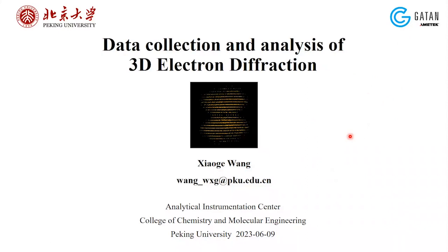Thanks, Gatan, for arranging this webinar. Today, I will mainly talk about data collection and the data analysis of the three-dimensional electron diffraction. For the data collection part, what are the keys to producing better data quality? And for the data analysis section, I will briefly review the data processing software and explain how the crystal structure could be determined from the three-dimensional electron diffraction data set.